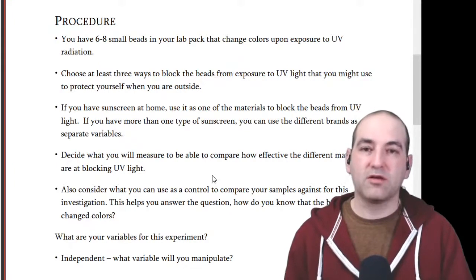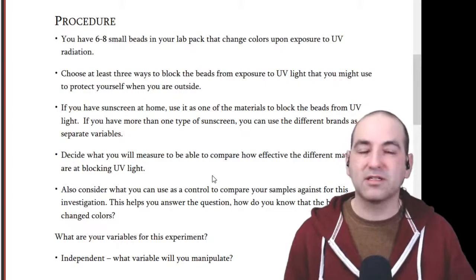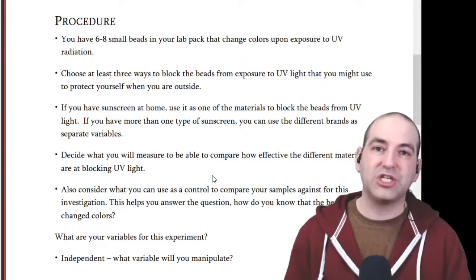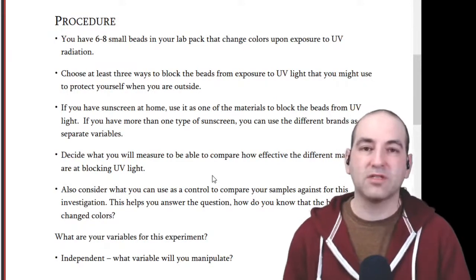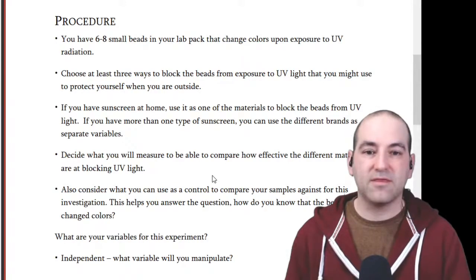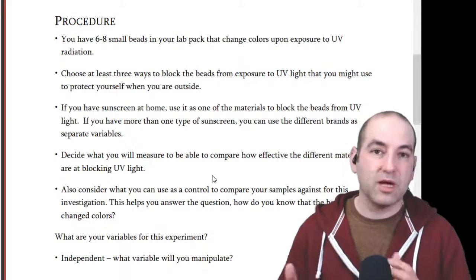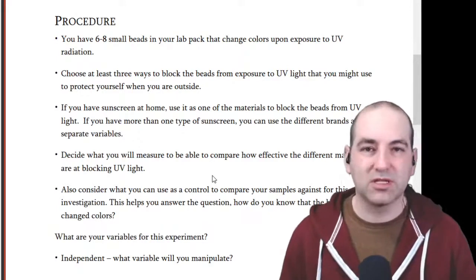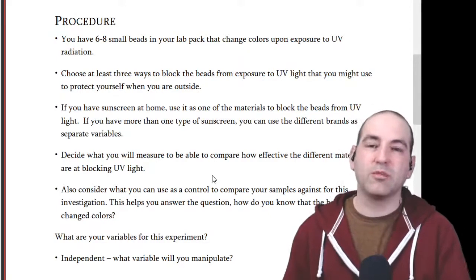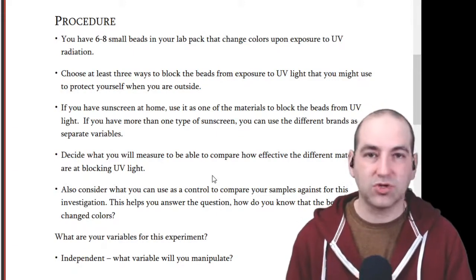So maybe you want to monitor them for a certain amount of time, and monitor when things have changed. Also, how do you define change? When you look at the beads, if you do a control where you just put the beads right out in the sun, you'll probably see that they don't immediately turn dark color, they kind of fade to that color. So are you going to try to measure the gradient, like, on a scale of 1 to 10, how deep is the color? Or are you going to just say how much time until it's all the way saturated? Those are all different choices that you have to make.